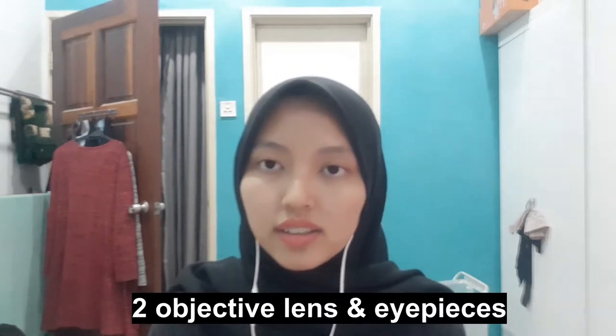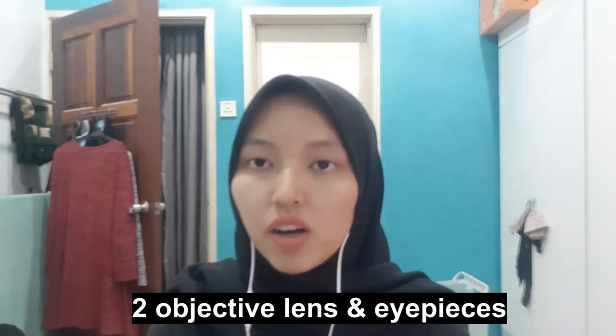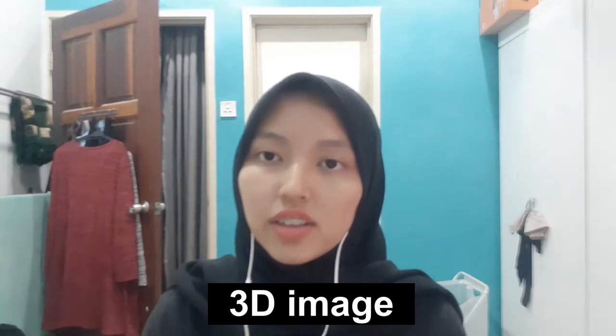Now, this is the basic knowledge when we talk about stereo microscope. Stereo microscope contains two separate objective lenses and eyepieces, which create two separate optical paths for each eye. As a result, it creates a 3D image of the specimen.